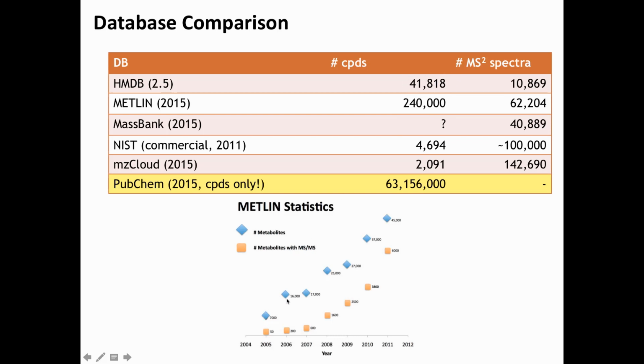And what you also see is that the numbers are growing very quickly. I'm not sure they're growing exponentially, but they're growing very quickly. So the odds that you are going to get an identification are getting better by the day. And that means it's also worthwhile that even after you did your search and you didn't come up with anything meaningful for the identification, and then 3 months later you rerun that stuff, you might get additional hits. I mean, it's not guaranteed, but it's definitely something to keep in mind. Since the stuff is growing, just rerun your identifications.